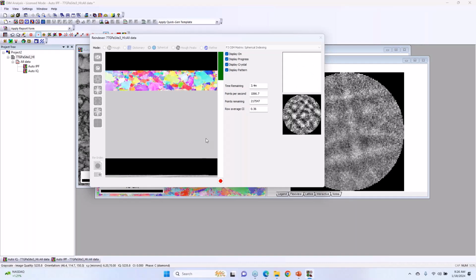If you look at this, you could say, yeah, it started fine, our confidence index goes down, and it would be correlated with the air conditioner going on in the room, and your scan coils go a little out of focus. Then they come in the morning, it comes back to equilibrium and it's back where they started. So unless you're going to stay overnight, we thought you want some sort of temporal indication of confidence index while you're indexing. That's the legacy of this: it gives an idea of how things go as a function of time, and this is just derived from confidence index.